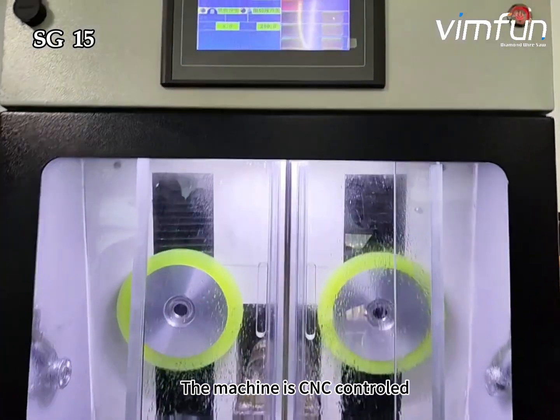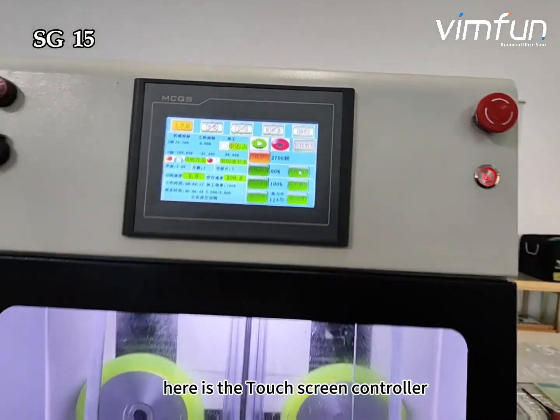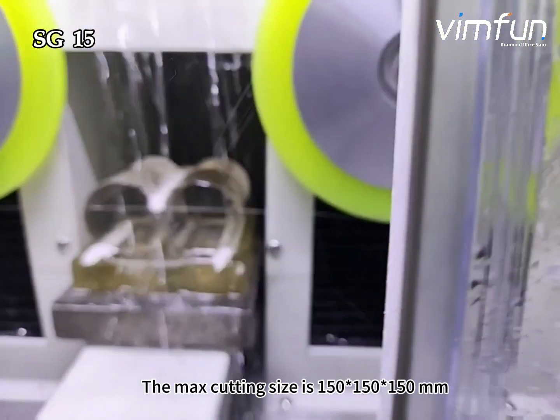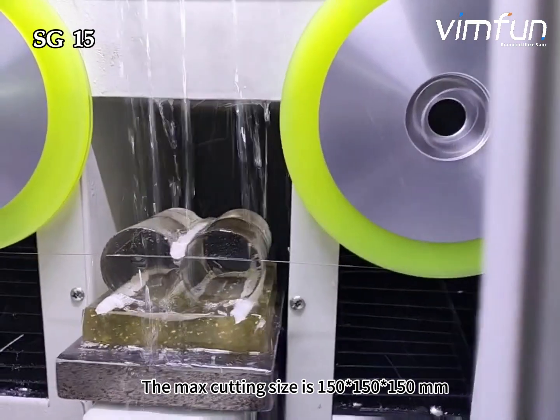The machine is CNC controlled. Here is the touchscreen controller. Open the window — you can see the cutting wire cut horizontally. The max cutting size is 150 × 150 × 150 mm.